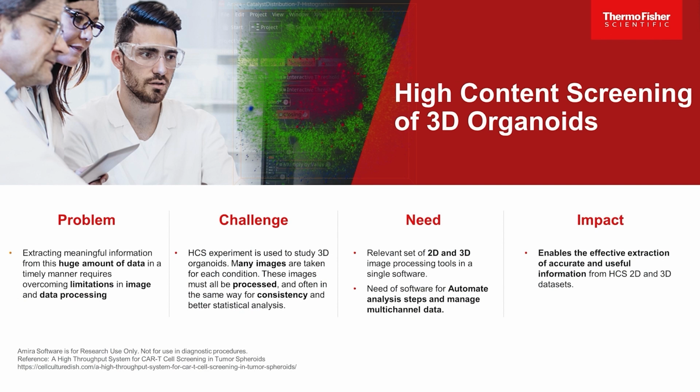The combination of HCS and 3D organoids creates a powerful platform which allows us to study many conditions and many images taken from each condition. In this second use case, we want to show you how Amira handles multi-channel HCS images of organoid models by extracting 3D information such as segmentation and penetration of immune cells into the spheroids. Rosa, let's dive into Amira and your demo.